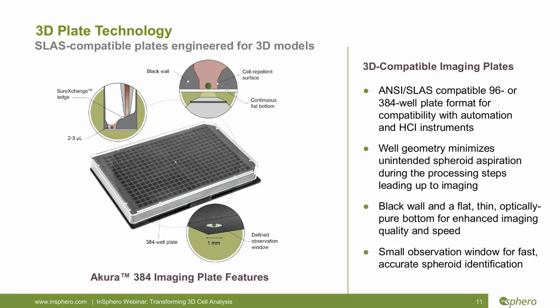The first is the 3D model, which for lead discovery applications needs to be robust and scalable. And the second is the 3D culture plate, because the type of plate can make a significant difference in the success or failure of your 3D imaging assay.